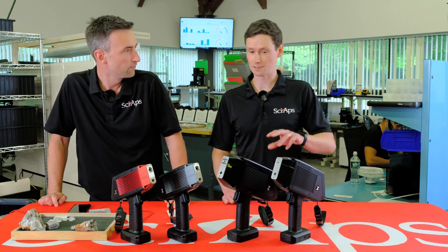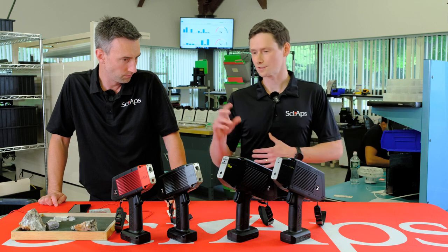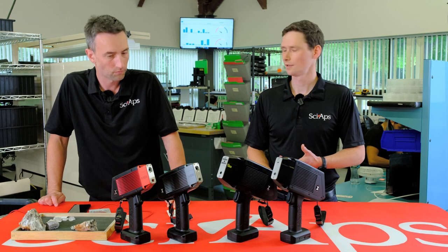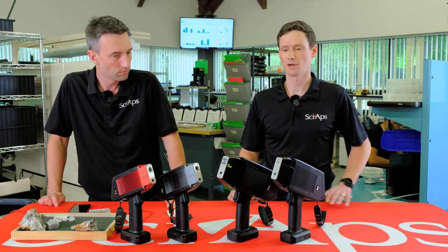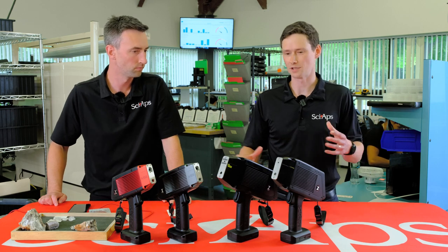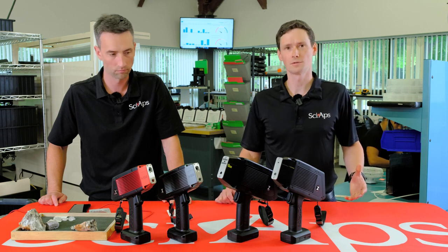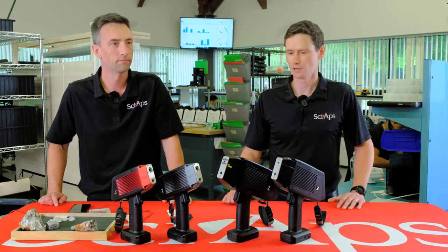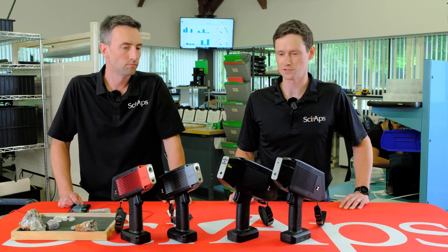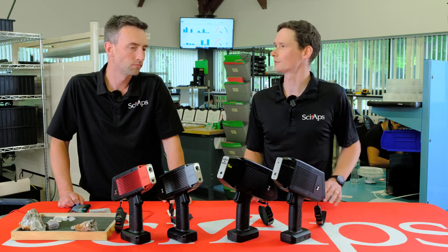And I think the other important thing to mention about LIBS is that, as you mentioned before, the lowest atomic number you can measure with the XRF is 12, for magnesium. And over here you can measure lithium, carbon, and oxygen. You can see emission lines for all these really light elements, and that opens up the whole world of what you could do portably in a handheld. Ben, I'm curious, as a geologist, what have you seen as the most groundbreaking applications for the LIBS?